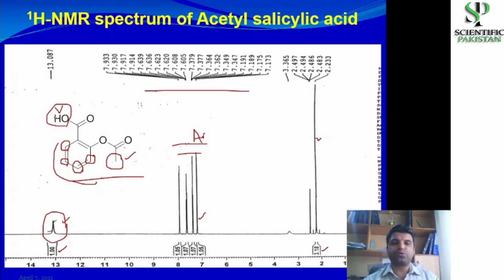So this is all about proton NMR spectroscopy. In the next session, we will talk about carbon-13 NMR spectroscopy. I hope you have got enough information about proton NMR spectrum. Again, the only way you can understand this is to practice, to study more and more spectra. We will have a practice session later on, and we will see how we can utilize proton NMR spectrum for structure elucidation.